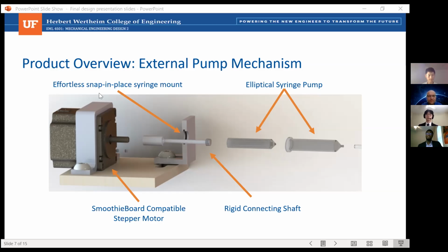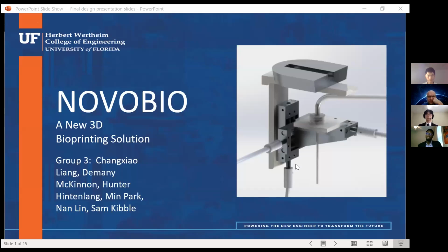So I've got a quick question on the design, guys. It looked like for your Z axis, you had the cable coming right down at the bottom of the Z axis. Yep, right down there. So do you have anything planned for how you're going to keep that from interfering with whatever's on top of the microscope? Because it looks like it's coming down and projecting right alongside almost where your print head is.